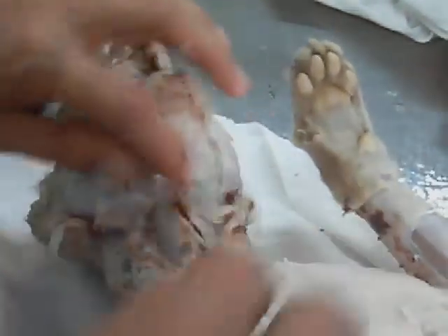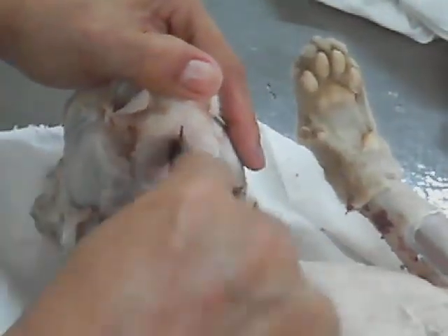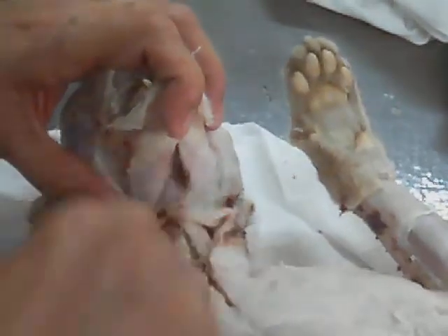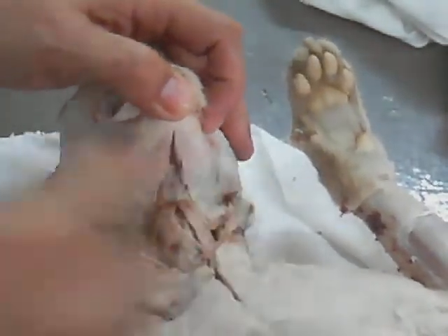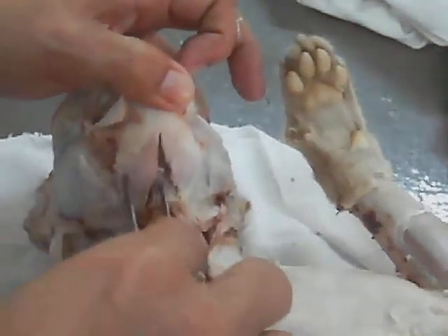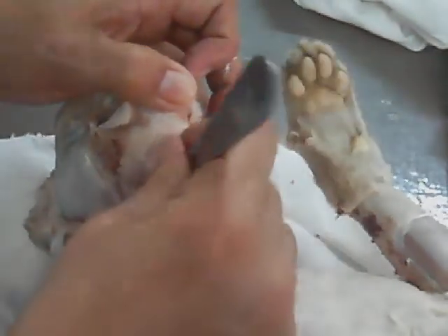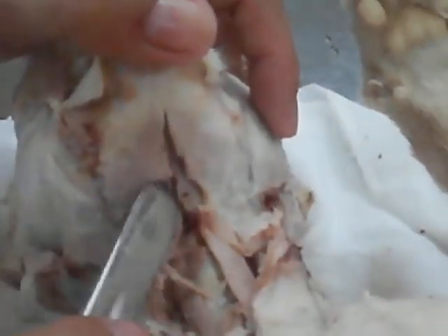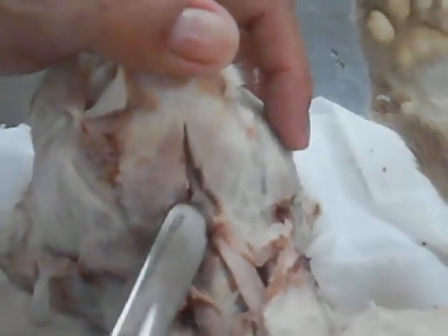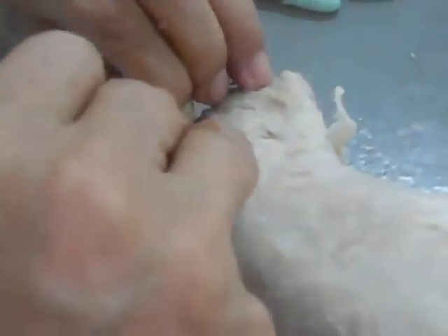Digastric. Mylohyoid. Geniohyoid is the second layer. The outer layer is the mylohyoid. The internal layer is the geniohyoid. And then we have the platysma.